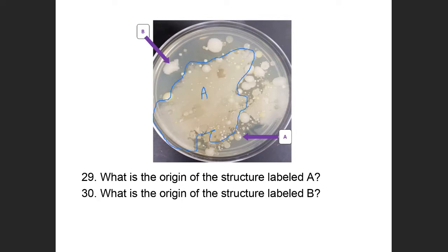So you have to understand the way that colony is formed, right? And so I might ask questions about what its margins are, and you would say, well, those margins are highly irregular, right? What's the size of the colony? It would be large, right? And then, of course, I might ask where that particular structure originated from? And because it's rough, it's likely to originate from soil because that is a bacillus, right? And when I say bacillus, I mean that that is the genus, therefore it should be underlined.